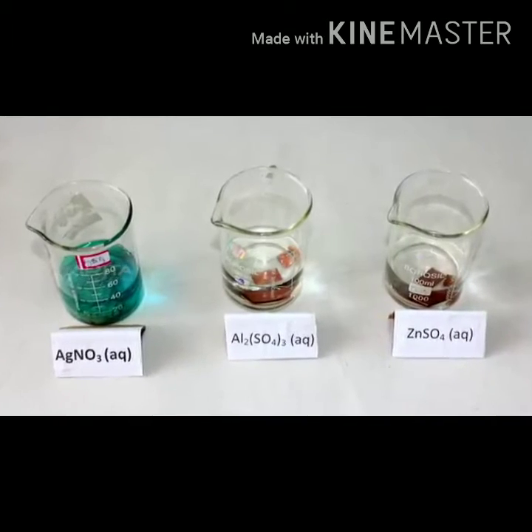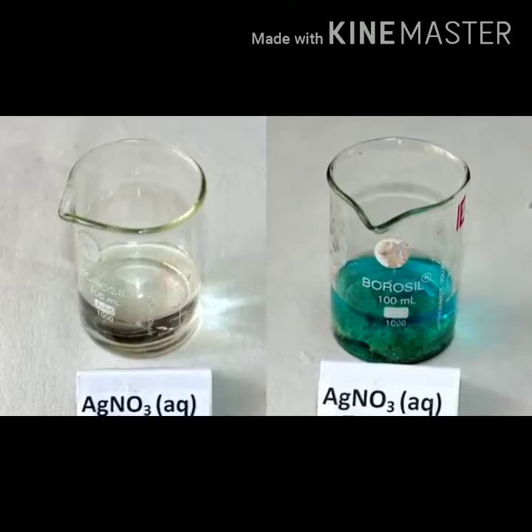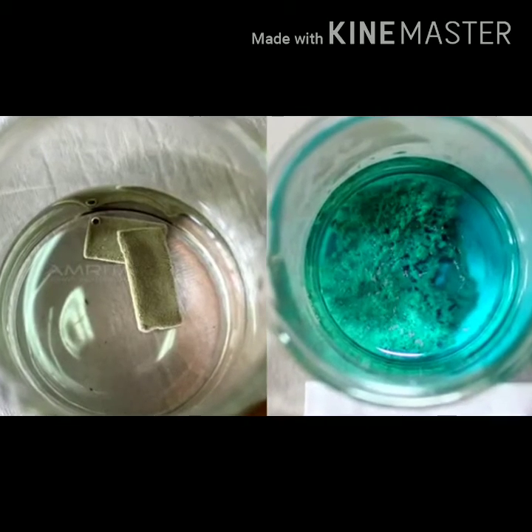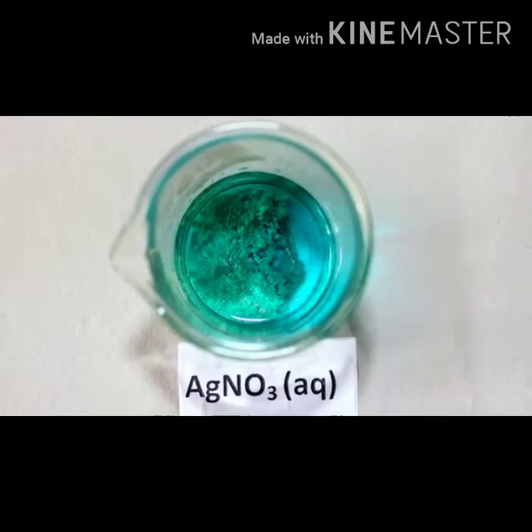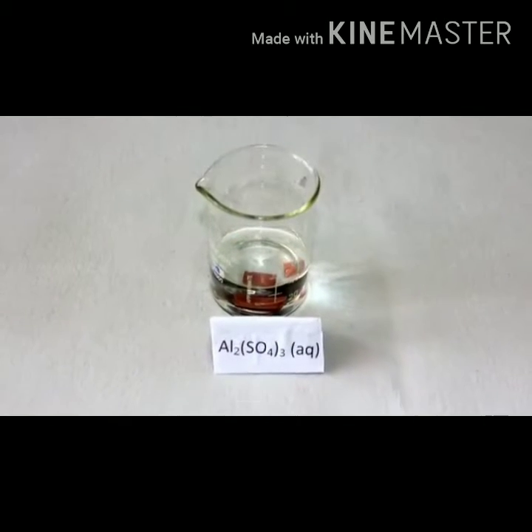After a day, the colorless silver nitrate solution changes to blue-colored copper nitrate solution and silver particles settle down at the bottom of the beaker. Here, copper is more reactive than silver, so it displaces silver from silver nitrate solution. In the other two cases, since copper is less reactive than aluminium and zinc, there are no changes observed in their salt solutions.